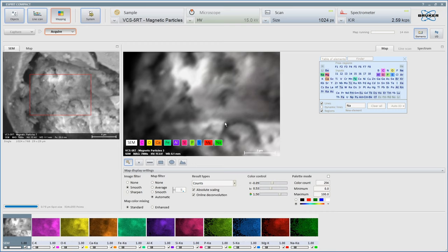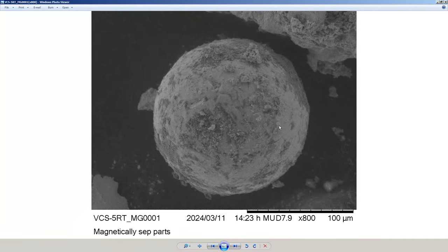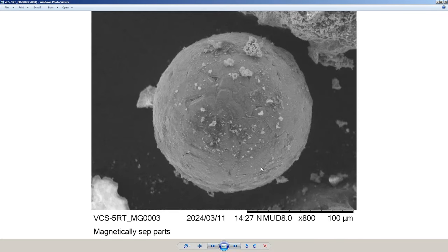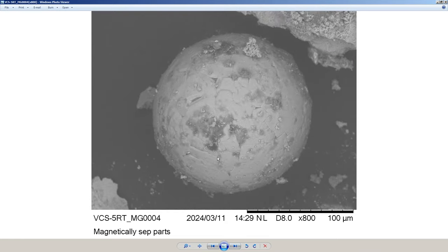Okay, so you're running a map now? I'm running a map, yeah. So that was the first one I found, and I couldn't see, but it did look like it had segments, but this is a very large one. This is like the ones that you produced, but it looks like it's been rolled around. It's messy, yeah. But then when I was going into it with slightly different settings, you can actually see here, you've got the crenellations there, starting, yeah. And it's the same thing, but it's like it's been smoothed off. It's like ball milled. Now here you can see them here.